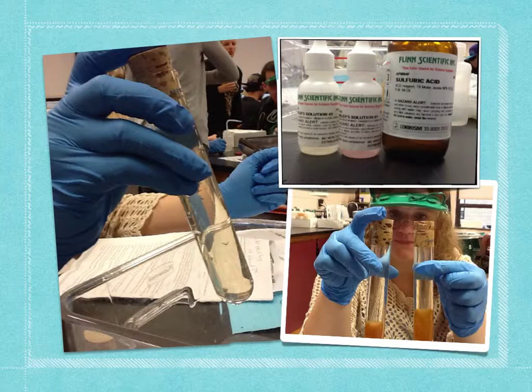In order to find the amount of dissolved oxygen in Oakford Lake, we had to follow a procedure of approximately 10 steps. Step 1. We took 2 different samples, both lake water and distilled water, and put them into separate flasks. We shook the flask containing distilled water to mimic dissolved oxygen in the water. Step 2. The 2 samples were then poured into separate test tubes. They were then immediately closed with a stopper.